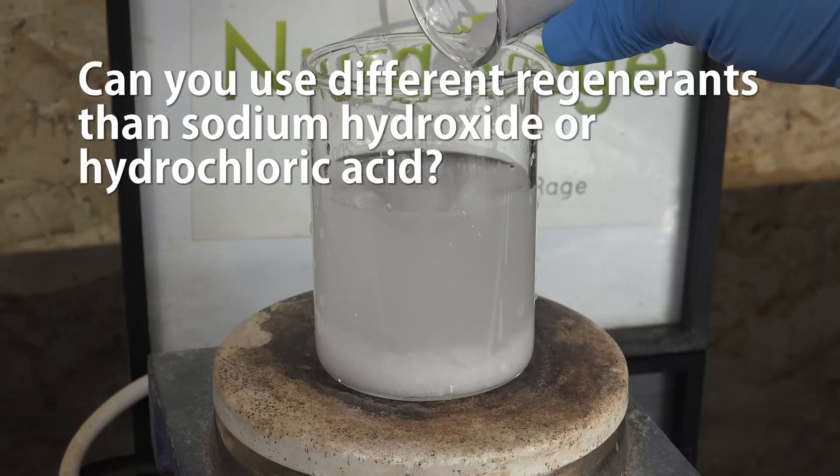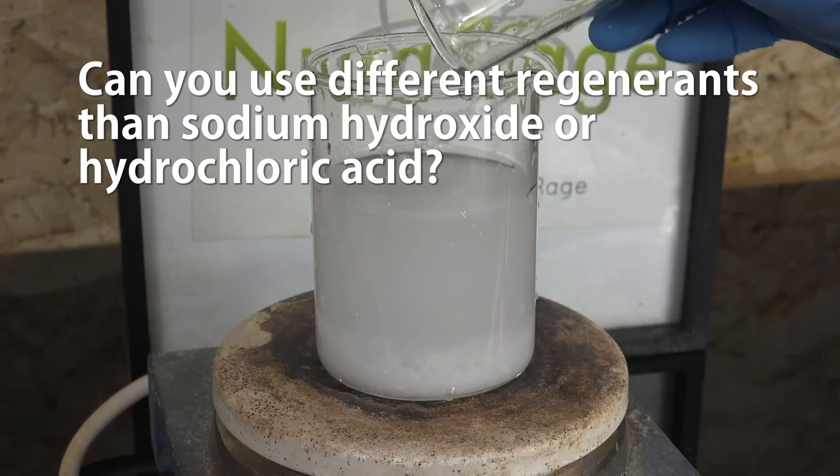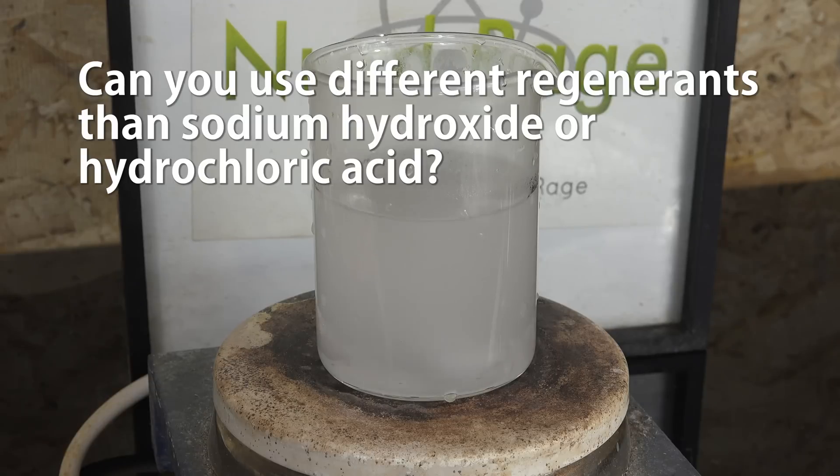Can you use different regenerants than sodium hydroxide or hydrochloric acid? Yes. As long as you provide a high concentration of your desired ions, you can exchange out the undesired ions absorbed onto your resin. For anion exchange, any strong source of hydroxide ions can be used — sodium hydroxide is cheapest and most popular, but potassium hydroxide also works. Hydroxides with low solubility like calcium hydroxide cannot be used because they can't produce high enough hydroxide concentrations. For cation exchange resins you need a strong acid — hydrochloric acid is most common, but sulfuric acid is a popular alternative. However, sulfuric acid can precipitate calcium sulfate, and accommodating that problem requires slowly ramping up acid concentration in a continuous flow system, which is only really viable in professional setups. For amateurs, stick with hydrochloric acid.